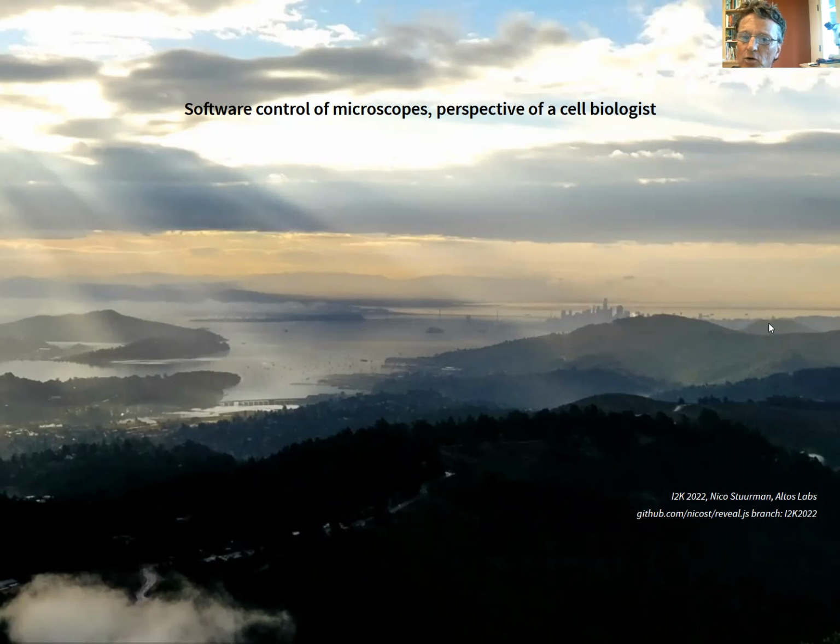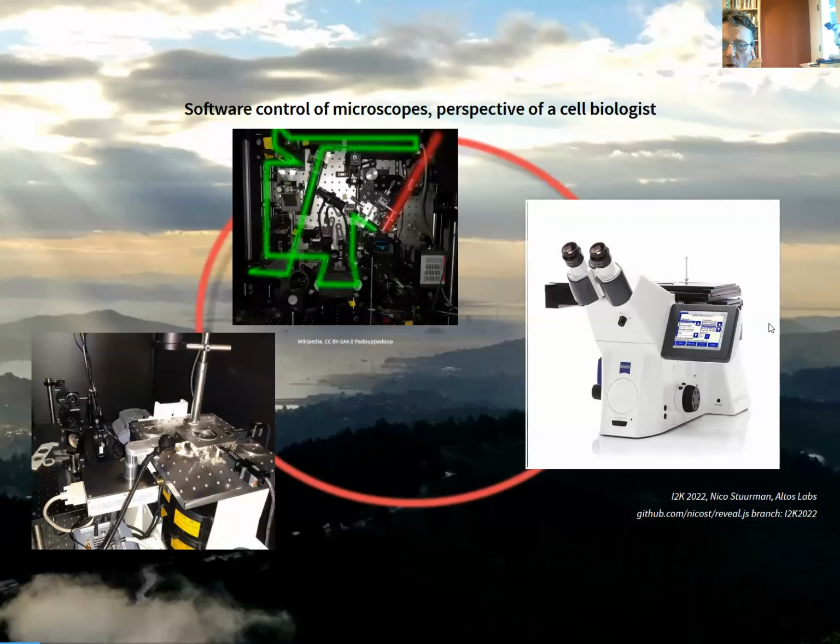So when we think about microscopes in cell biology, it ranges from these sleek built systems like this Zeiss microscope on the right that comes with software, to custom built systems like this lattice light sheet, or what we were often using, kind of a combination of the two, something commercial but with some add-ons. And software control became super important.